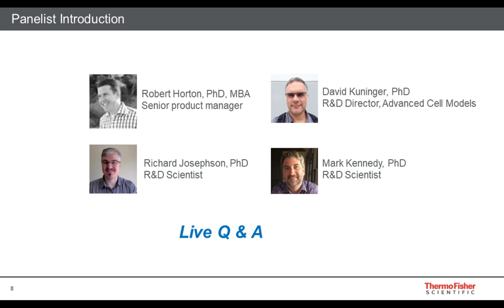Great. And then, obviously, one of the challenges today, I would argue, is just reproducibly and consistently growing the models, right? We actually have two great questions along those lines, and I'm going to combine them into one. What is the typical percentage of organoids that are successful from the total generated in an experiment? And the second question is very closely related: how reproducible is the production of neural organoids starting from iPSCs with today's protocols? So really, they're both asking, what is the current success rate from your experience? What's normal? And any comments you can add there?